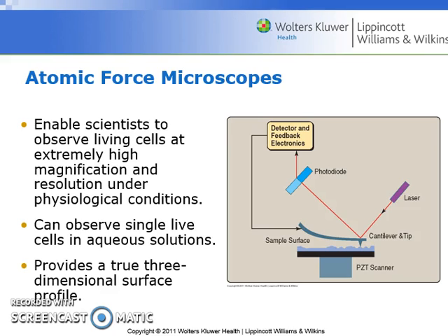And in addition to this, you also get to see a three-dimensional profile, or a 3D type of image, when you view these microorganisms in this type of framework. So AFM microscopy is very useful in allowing us to see all the intricacies and the interactions that might exist between cells, as well as enhance our view of the attributes of the cells that we're viewing. And so the AFM is very, very helpful.